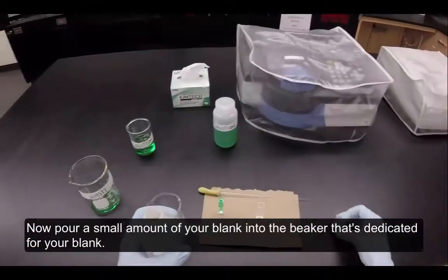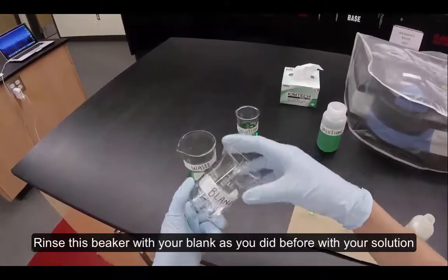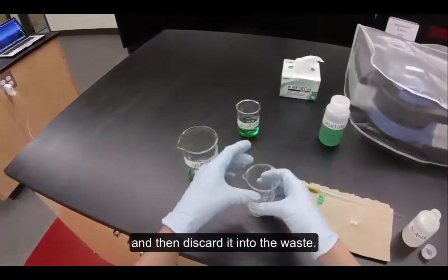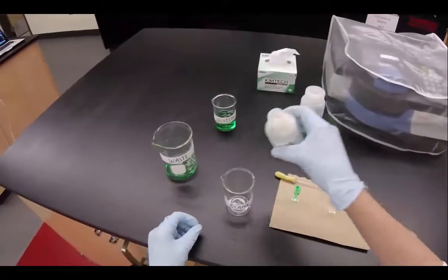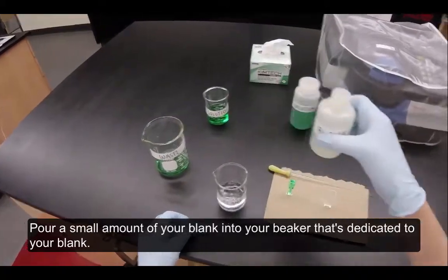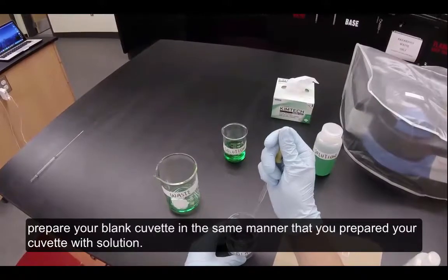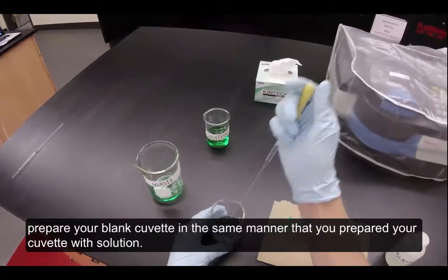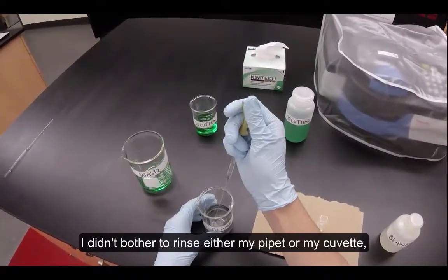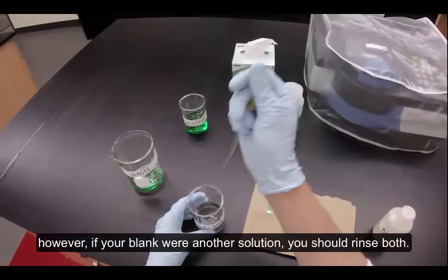Now pour a small amount of your blank into the beaker dedicated for your blank. Rinse this beaker with your blank as you did before with your solution, then discard it into the waste. Pour a small amount of your blank into the beaker dedicated to your blank. Using a new pipette, prepare your blank cuvette in the same manner that you prepared your solution cuvette. Since my blank was deionized water, I didn't bother to rinse either my pipette or my cuvette. However, if your blank were another solution, you should rinse both.